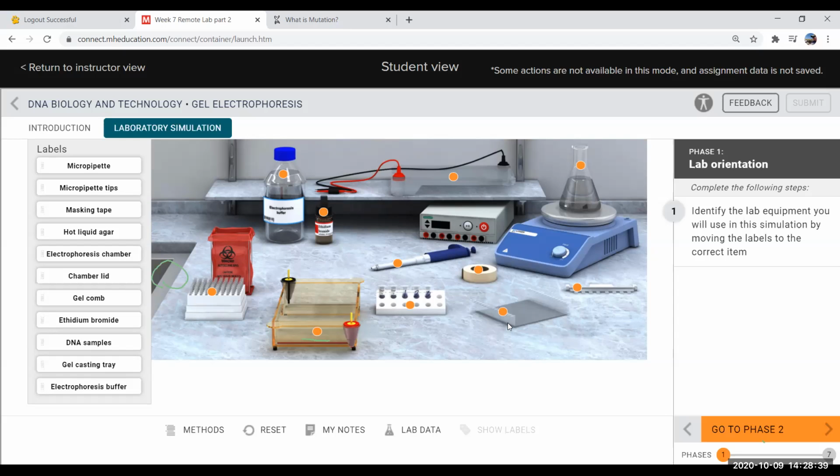It's a little plastic cassette, and we often use tape to bind the ends. So you literally put a piece of tape on the front and on the back, and essentially you've made a Jello mold. Now, we also mentioned that you're going to need wells or holes in the gel itself. So what we do is place this, called a gel comb, on top of the agarose gel case. Now we have a nice little system that allows the gel to have a very specific shape.